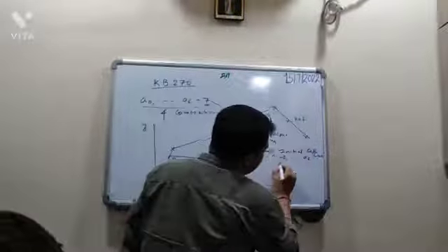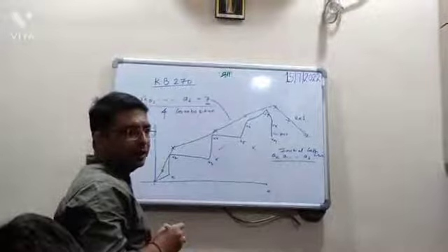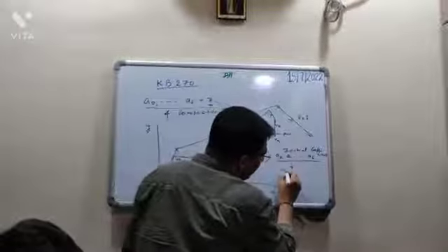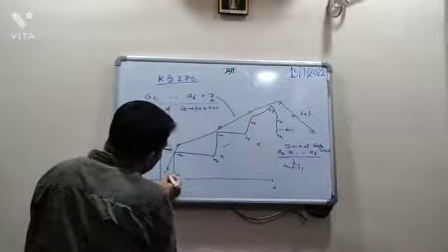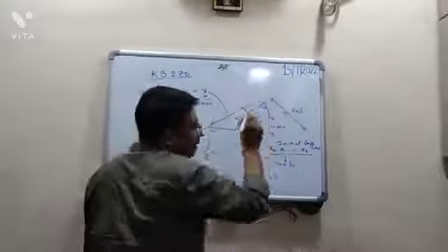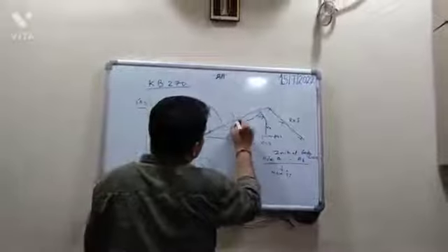Now what will the machine do? The machine has this reference, 7 coefficients, right? Now the machine will adjust these 7 coefficients and modify them in such a way that this blue plot will try to match with the green one. So it will try to align with this.